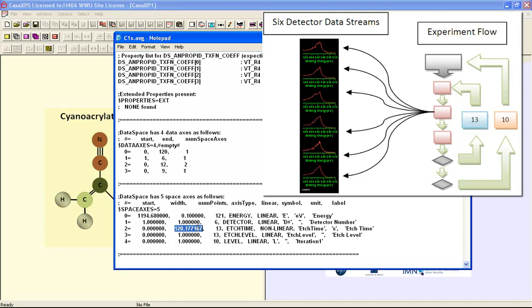However, in this case we have a further control item which is an iteration. And this is performed 10 times.